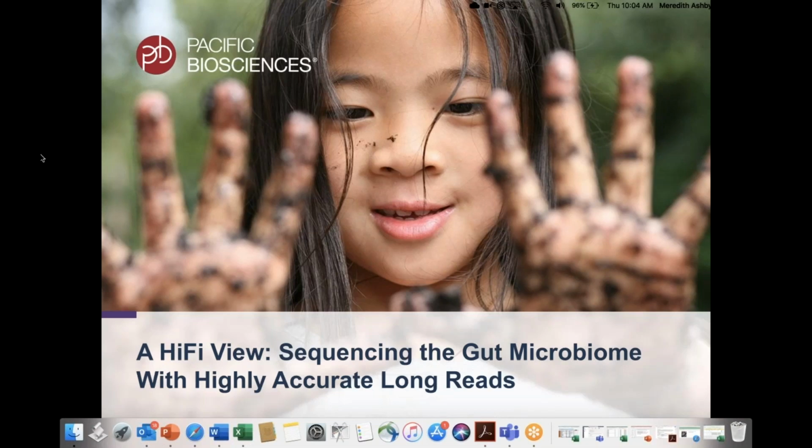Today's topic is going to be focused on PacBio HiFi sequencing and how it can help you overcome some common challenges in microbiome research, including ambiguous taxonomic assignments and culture-resistant bacteria.